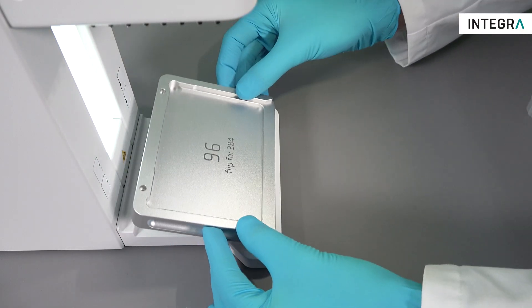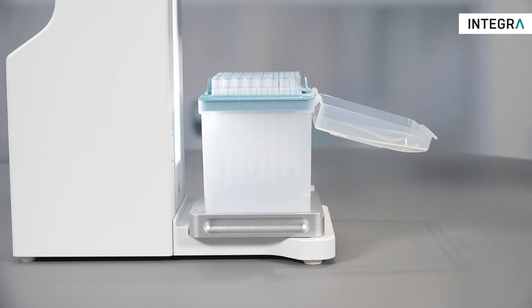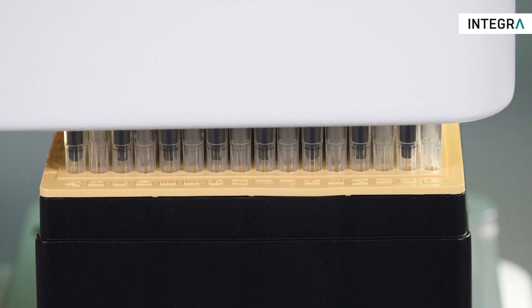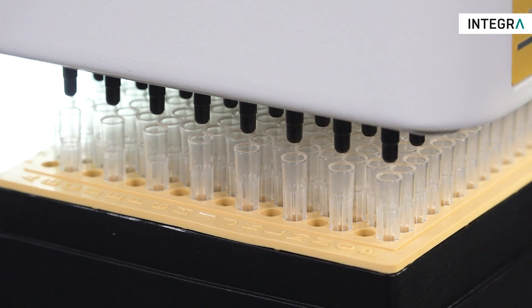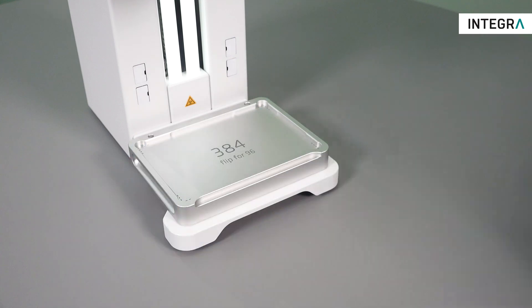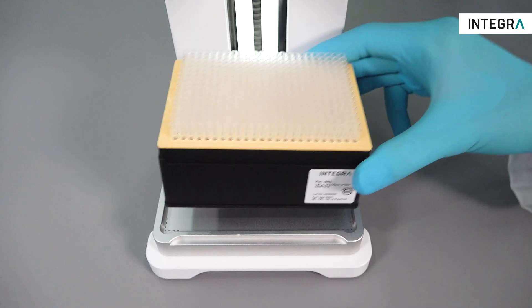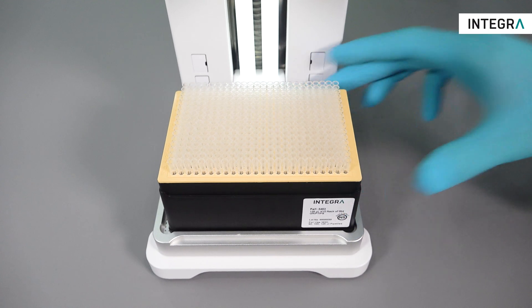To load grip tips for 300 and 1250 microliter versions, place the tip rack on the 96 side of the base stage. To load grip tips for 12.5 and 125 microliter versions, place the tip rack on the 384 side of the base stage. Position the tip rack into a corner of the base stage — these racks can be loaded four times.